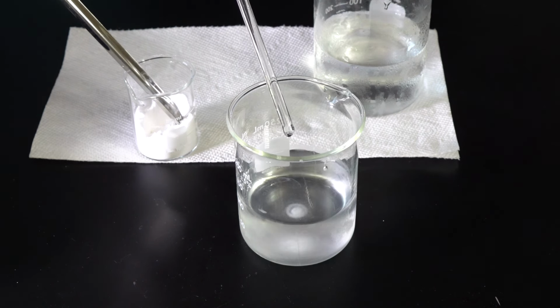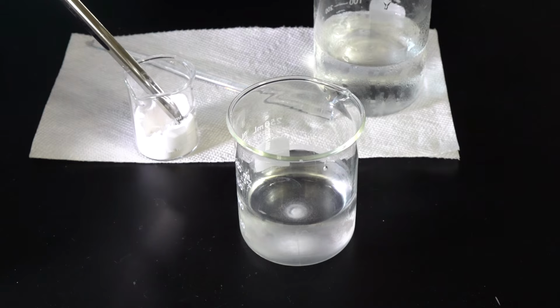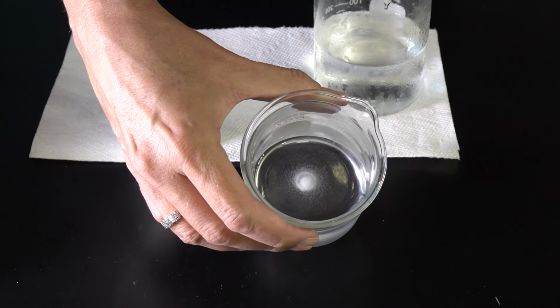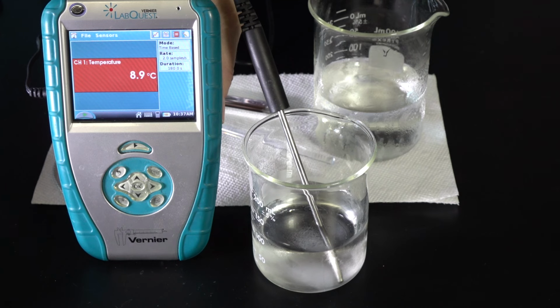This time, as I take my stirring rod out, I can see that there is about the amount equal to the size of my small finger still on the bottom. So that'll be my end point. Measure the temperature of the water and record it in the data table.